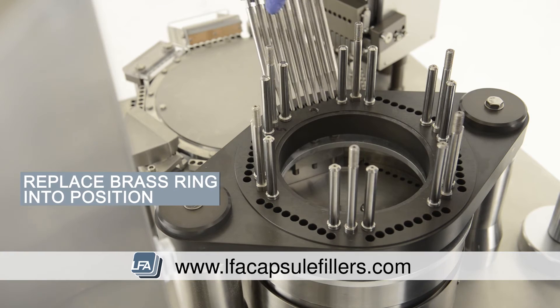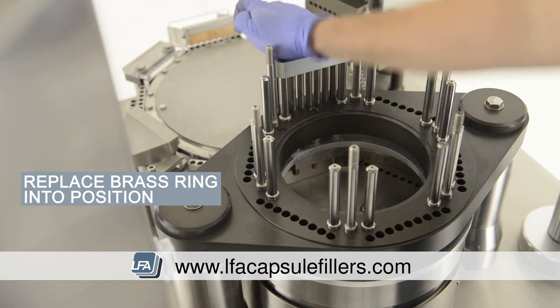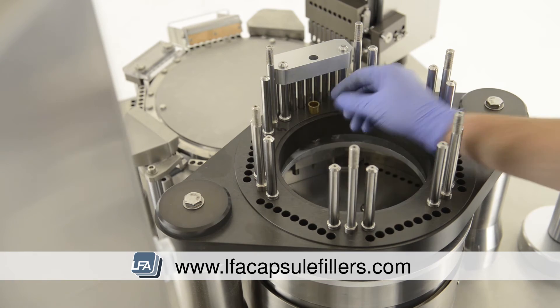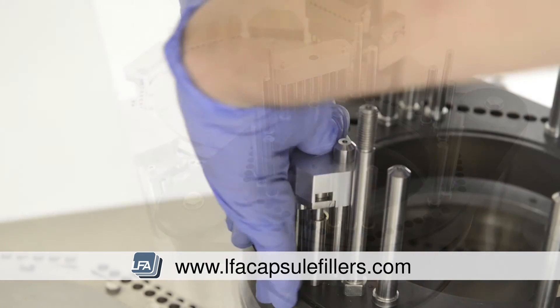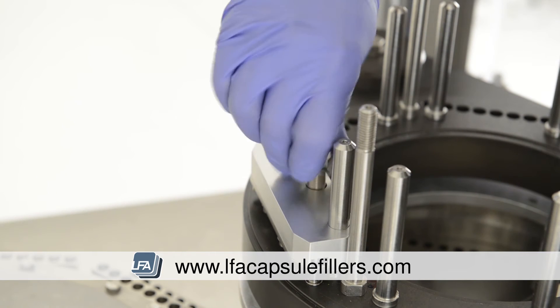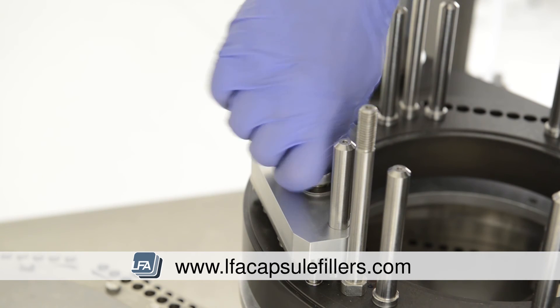Now we're replacing the block with our first tamping tool. Whilst doing this, we need to place our brass ring into position. Replace the 90mm bolt into the block and through the brass ring and then tighten fully.